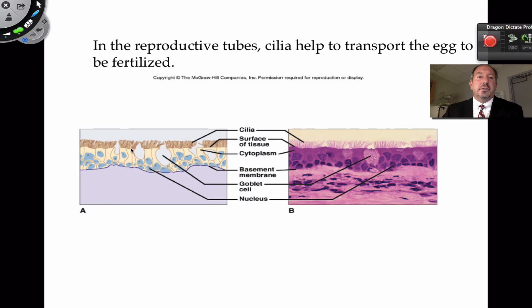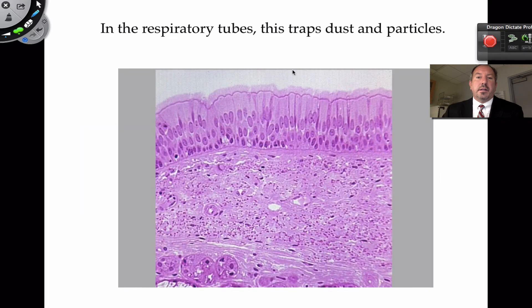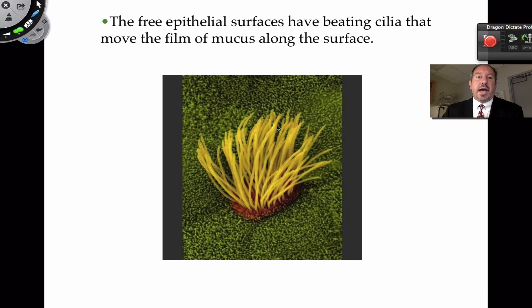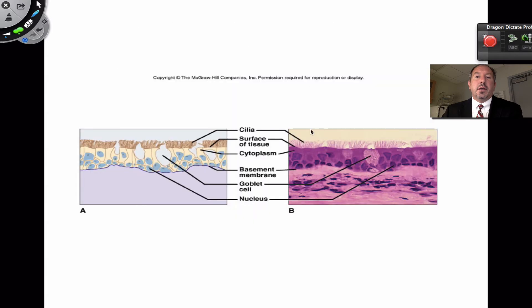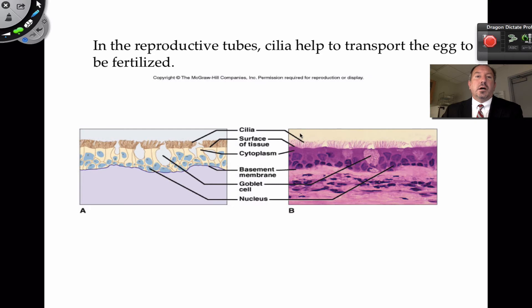So this is a great shot of pseudostratified ciliated columnar — it's a mouthful. Here are the goblet cells, here's the basement membrane, and these blue circles are the nuclei. Here's the cilia. Cilia are simply protein tubes that sway back and forth to help move the mucus along, and as mentioned, they also move the egg in the fallopian tubes.